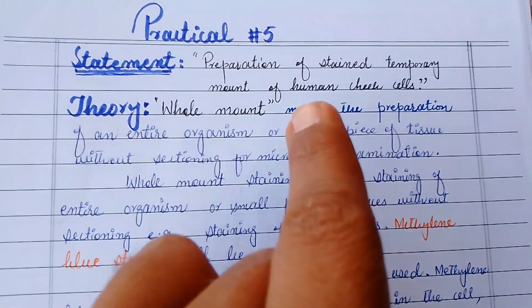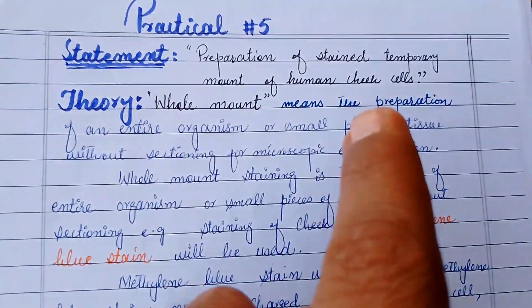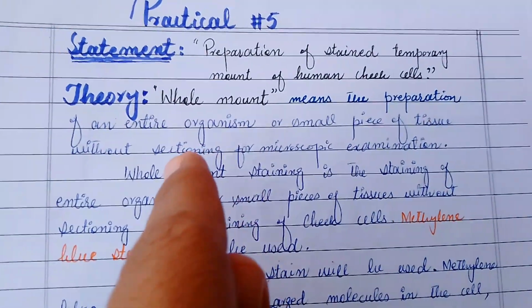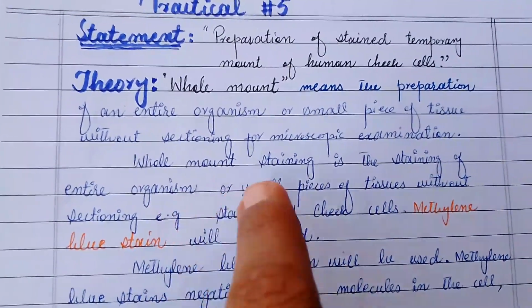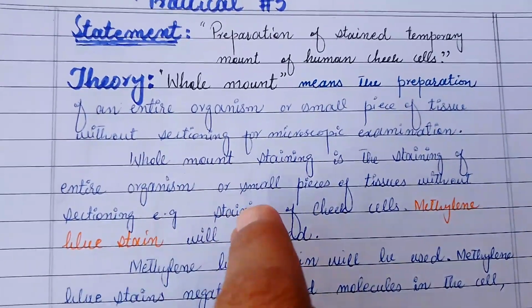Today's practical is preparation of stained temporary mount of human cheek cells. Theory: Whole mount means the preparation of an entire organism or small piece of tissue without sectioning. For microscope examination, whole mount staining is the staining of an entire organism or small piece of tissue without sectioning. For example, staining of cheek cells.